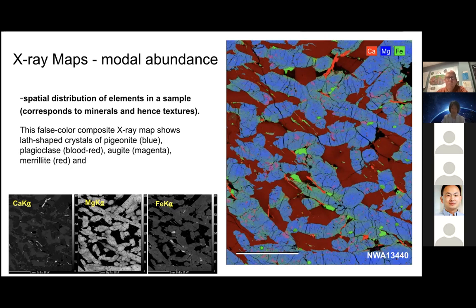Now, in Dr. Huang's lab, we have an instrument called a mass spectrometer that gives us a much higher precision method to do that by measuring trace elements that occur in concentrations down to parts per billion. But this gives us a good first round assessment of what the bulk composition of a sample is.